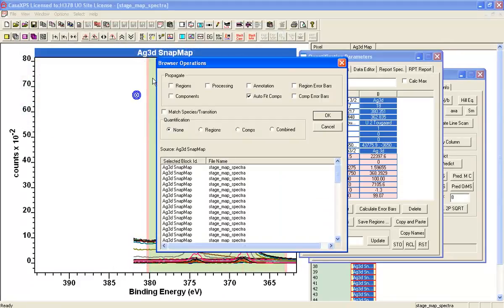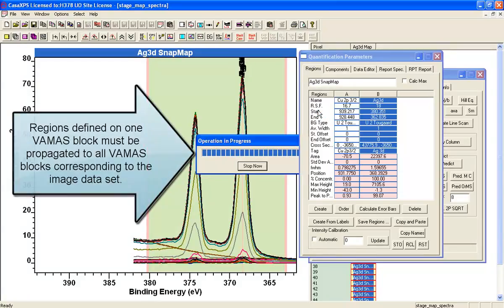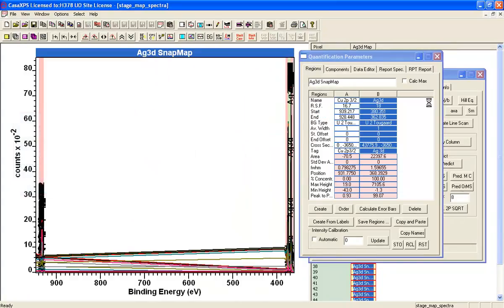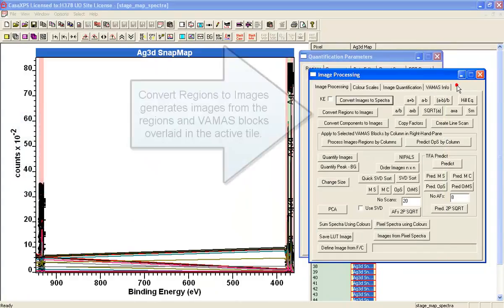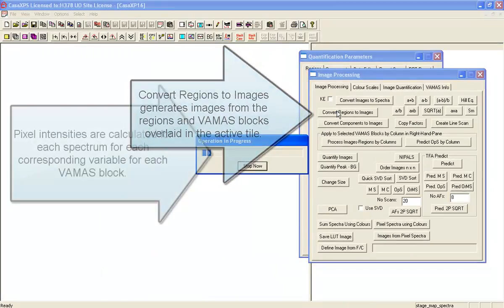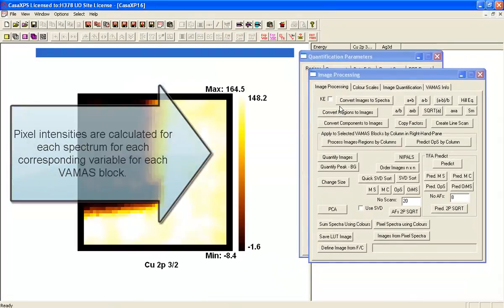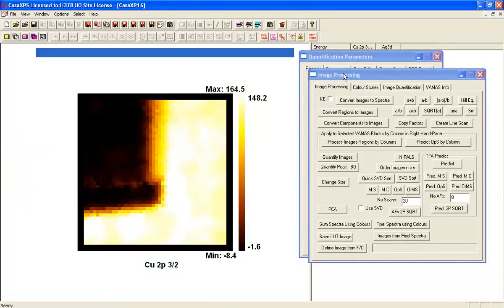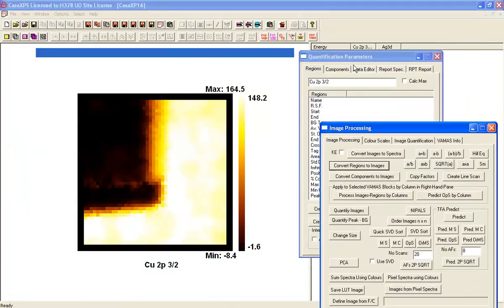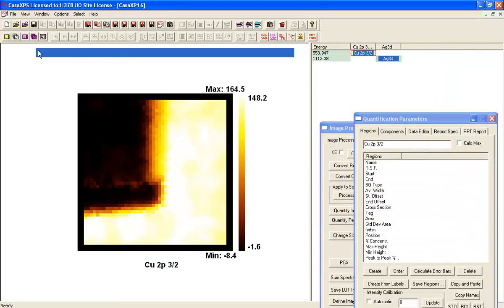We propagate the regions. These are overlaid in the active tile so I can then convert regions to images, and so we get our first view of what these images look like.